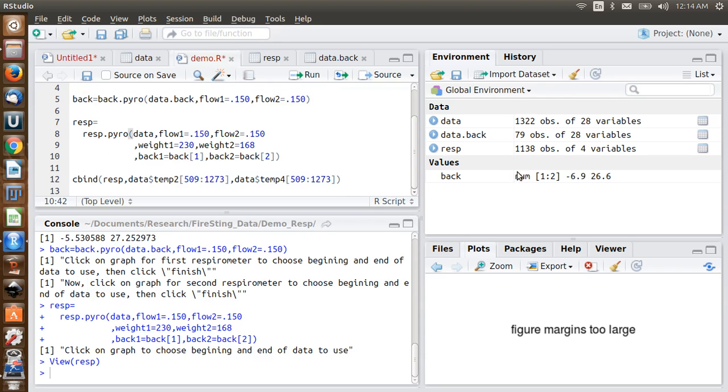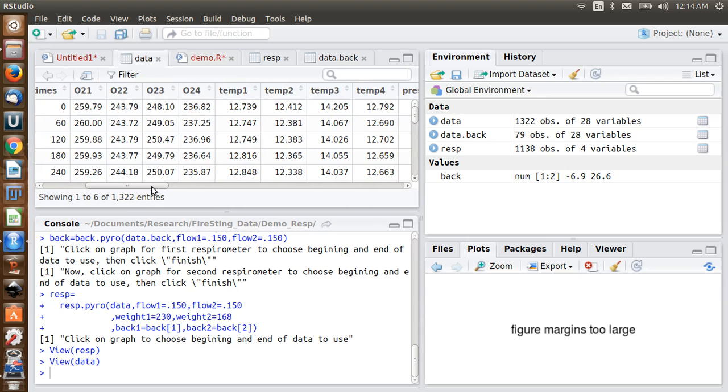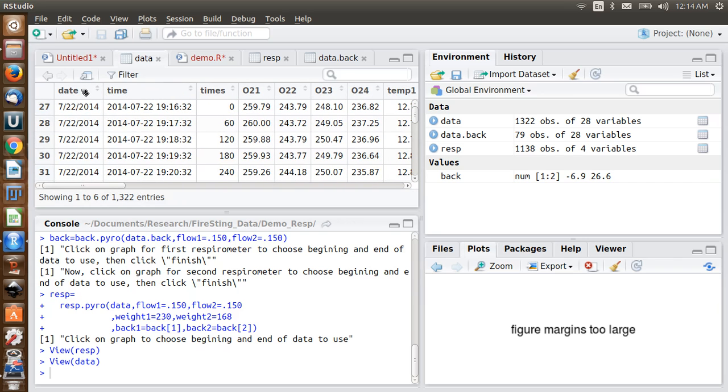If we come down here, however, we can pull data from our data set also. So let's imagine we want to pull the temperature values and add that to our data set as well. We have temperature 1, temperature 2. These are in columns. Let's count over: day 1, 2, 3, 4, 5, 6, 7.